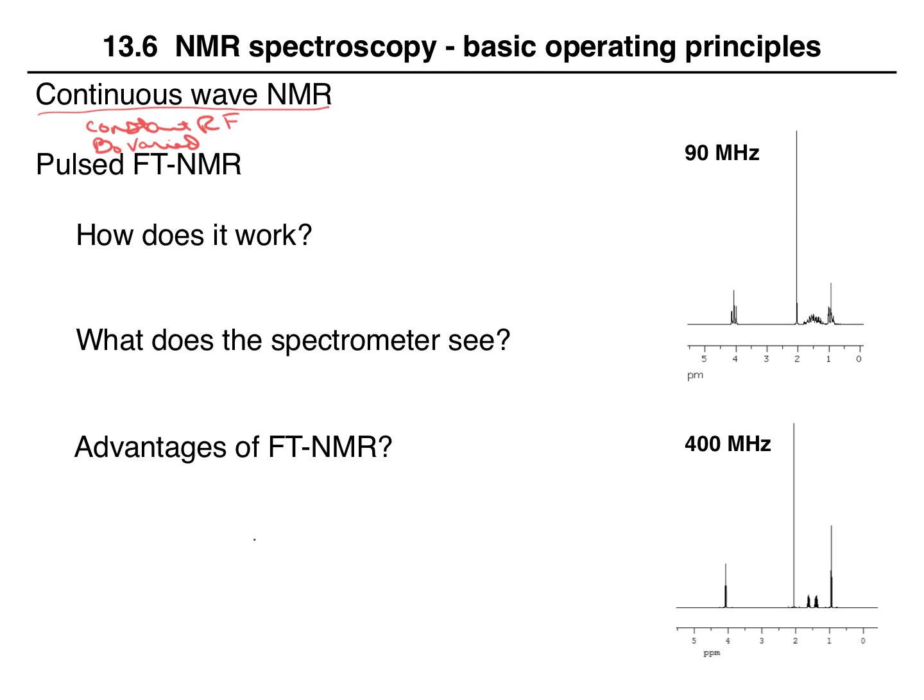So this method is not used anymore, but it did give us particular terminology, such as talking about upfield and downfield. I tend to avoid using these terms, and in fact, I always have to remind myself of the rule. To the right of the spectrum is upfield, on the left side of the spectrum is downfield. Depending on the way you learned about this, you might be most comfortable with upfield, downfield, but this is where it comes from, an obsolete type of instrument.